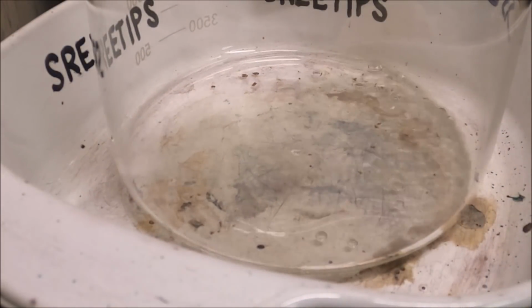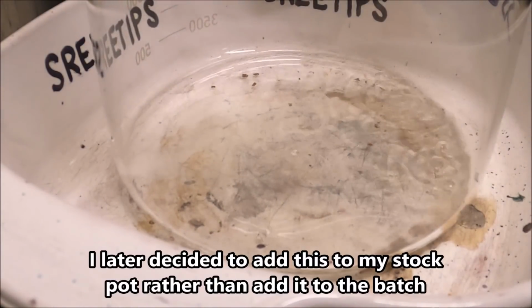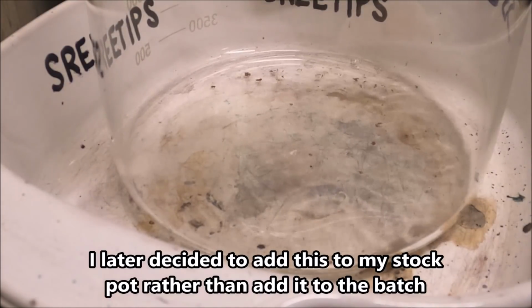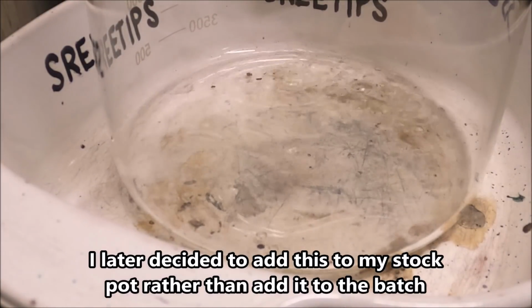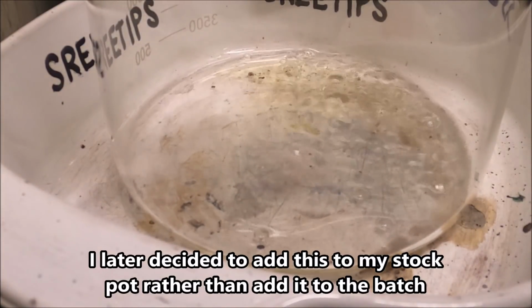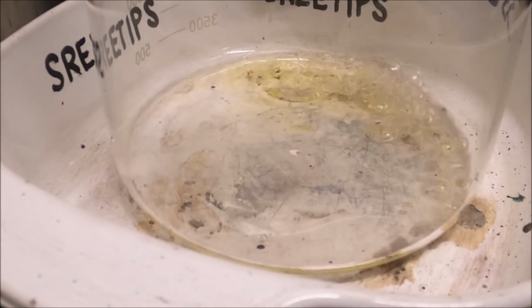Few pieces of undissolved gold. I put them in the beaker here, added some hydrochloric acid. Now I'm going to add a little bit of nitric, get the rest of this stuff to dissolve. Just drop some time here. Get the rest of these little pieces of gold to dissolve.